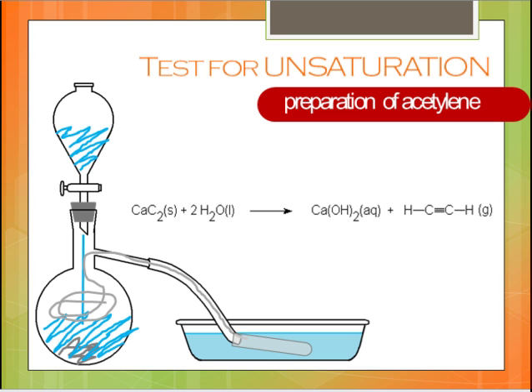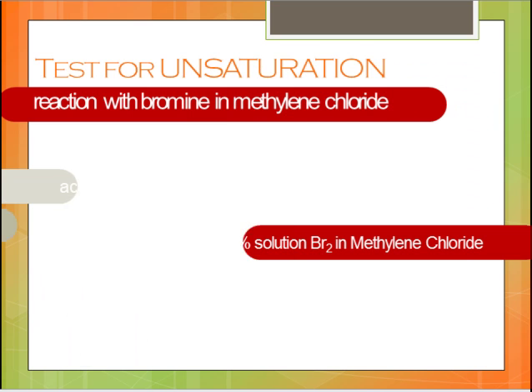While making acetylene gas, keep in mind not to be working near hot stoves or fires, because if we did, well, we might blow the lab and, more importantly, ourselves up. So be careful. Okay, so getting back into the discussion.